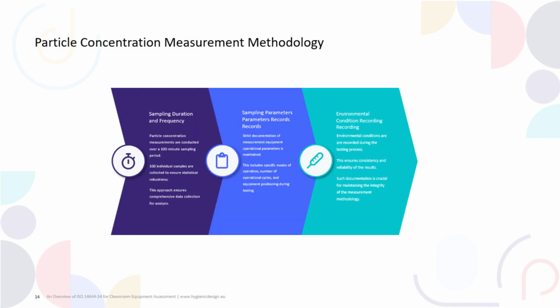During the final measurement, sampling duration is set at 100 minutes, during which 100 individual samples are collected. This extensive sampling ensures statistical robustness and provides comprehensive data for analysis.